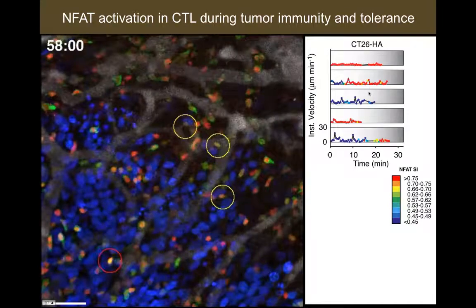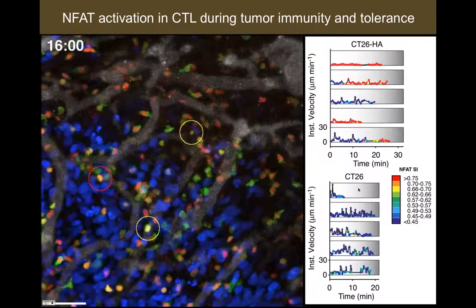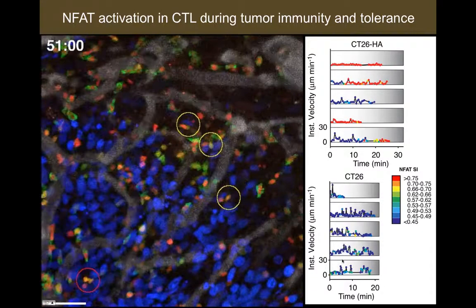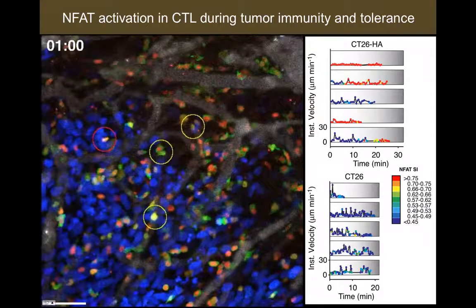And this is just a control tumor, so here we don't have expression of hemagglutinin in the tumors, and obviously as a result we don't have NFAT activation, and the cells tend to migrate even more freely than with the present approach.